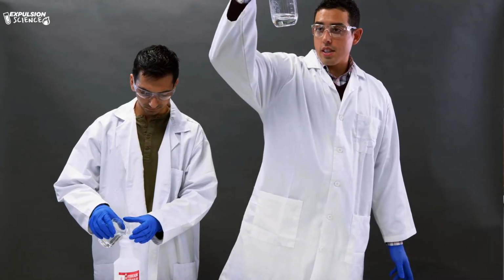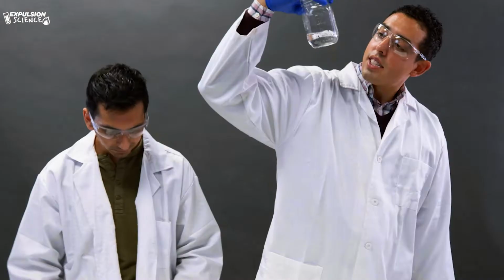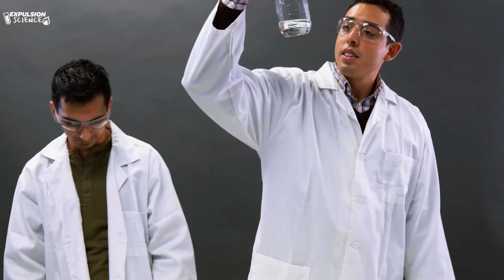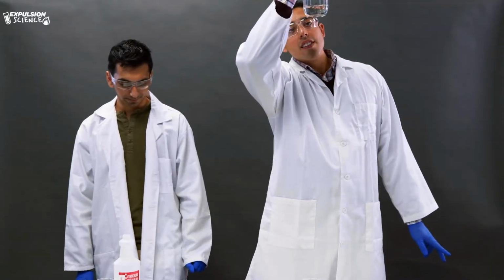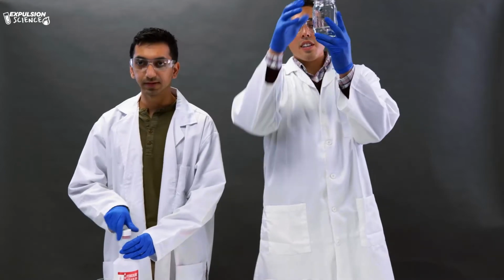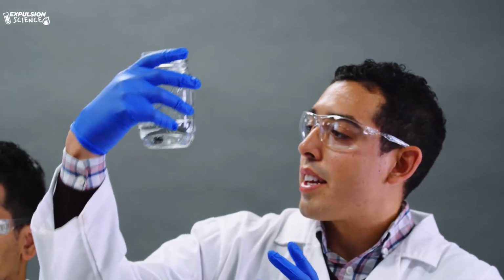So it doesn't look like there's a lot of reaction here with the tin. It seems to be roughly solid. It is bubbling a little bit around, but nothing immediate. Looks like the same can be said for our copper. Not a lot of bubbles attached to it at all. It's just kind of sitting there inert. Our square of carbon looks to have some bubbles attached to it, but also not any immediate dissolving.